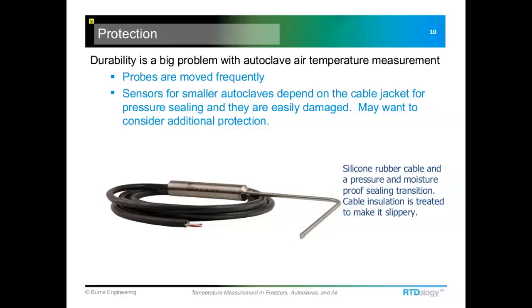If durability is an issue, the next step up from this style probe would be to go to a cable that has the hose covering over it.